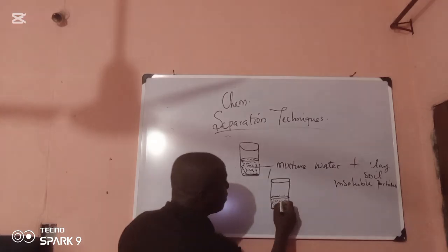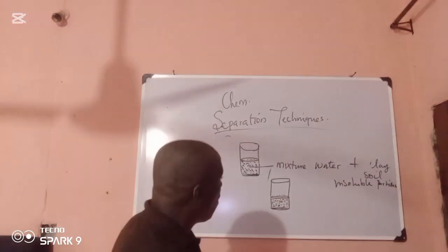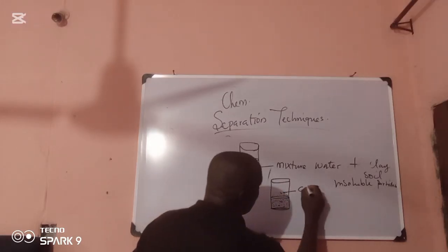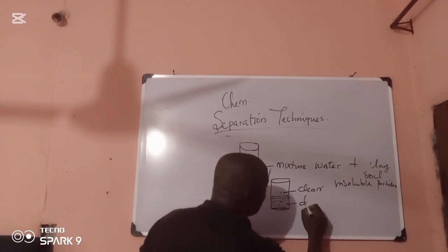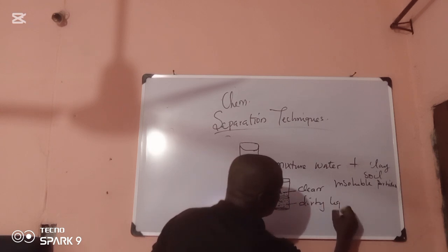The heavy one, or the clay, will go to the bottom, while the clean liquid is on top, and the dirty liquid is below.